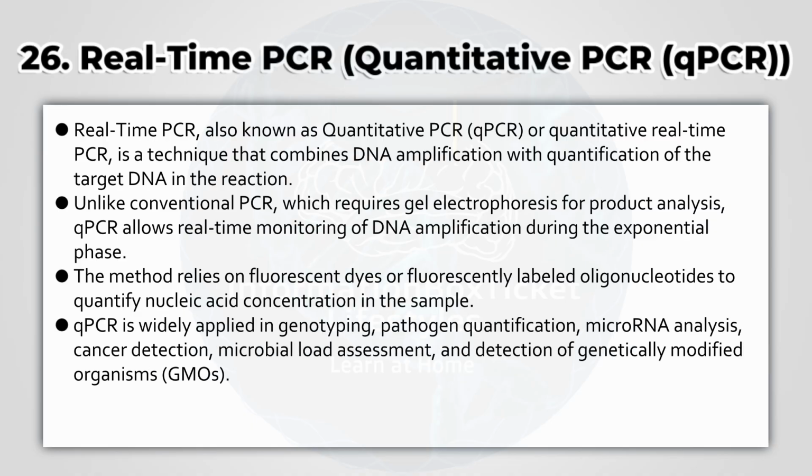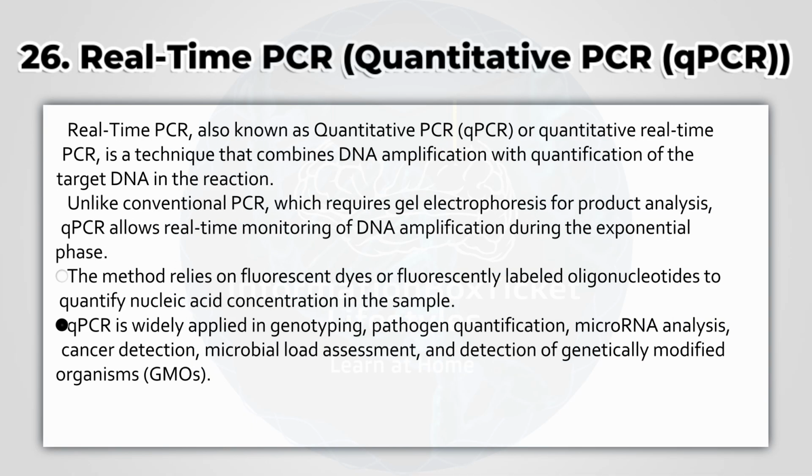qPCR is widely applied in genotyping, pathogen quantification, microRNA analysis, cancer detection, microbial load assessment, and detection of genetically modified organisms, GMOs.